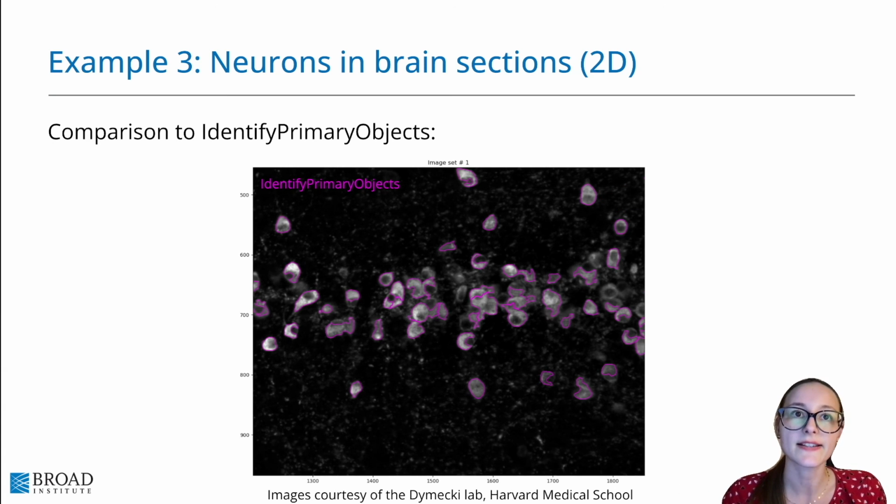Where it falls flat are cells where the nucleus is off to the side, and so we get that C shape, like here and here, or examples where we have clustered or clumped cells. We see some cases of under-segmentation, like this and here, and some cases of over-segmentation, where we have a large cell, but the nucleus is again off to the side.